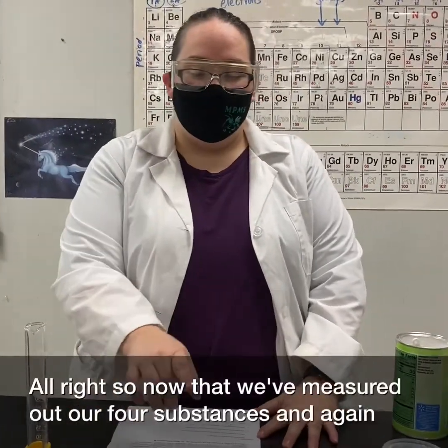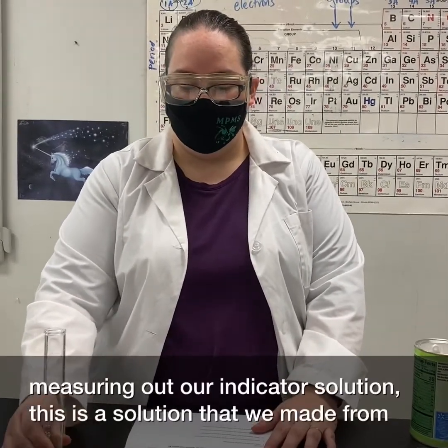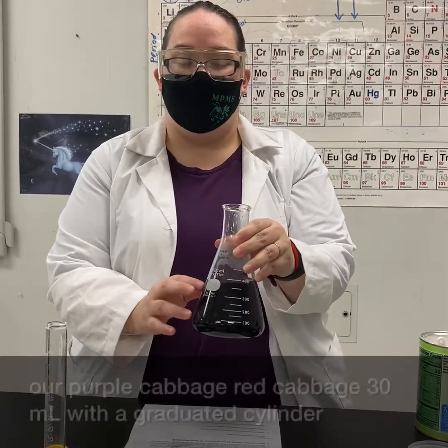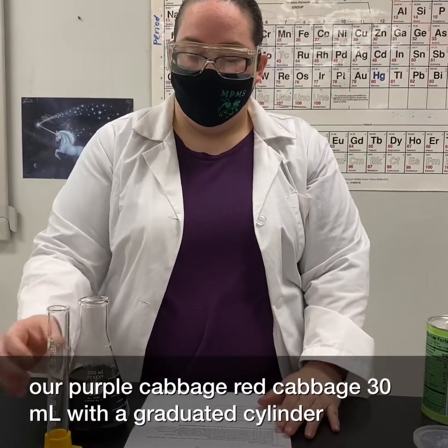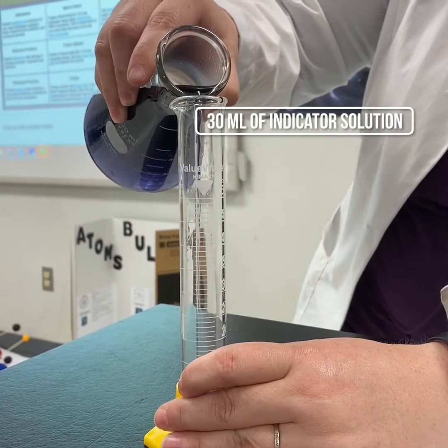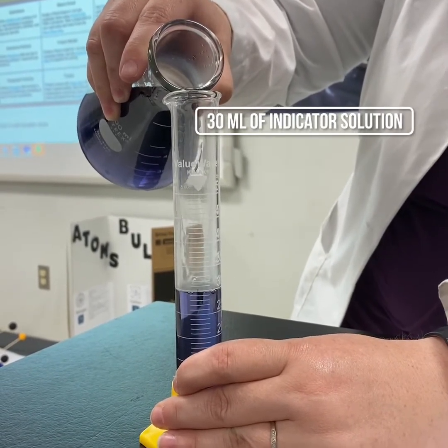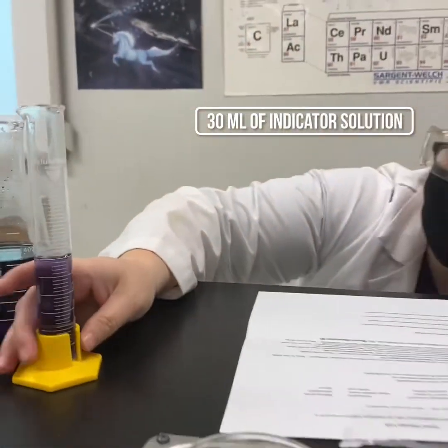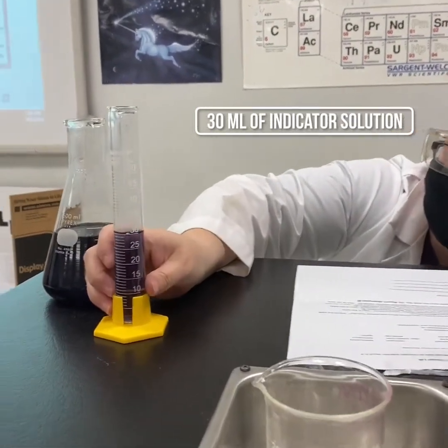Now that we've measured out our 4 substances, half a teaspoon of each, we're going to start measuring out our indicator solution. This is the solution that we made from our purple cabbage, also called red cabbage. We are going to measure out 30 milliliters with our graduated cylinder. You want to get it precise, and the way you do that is you go down and view at the bottom of the meniscus. Remember, the meniscus is the curved line here.